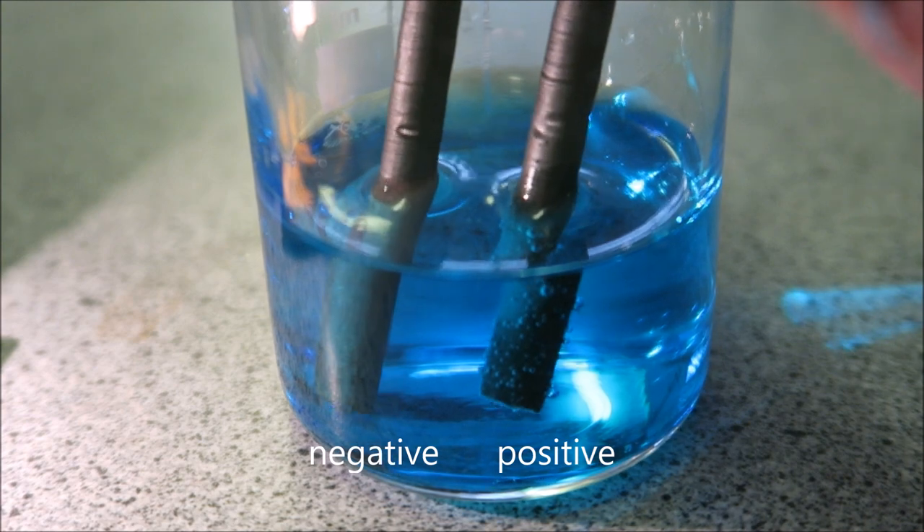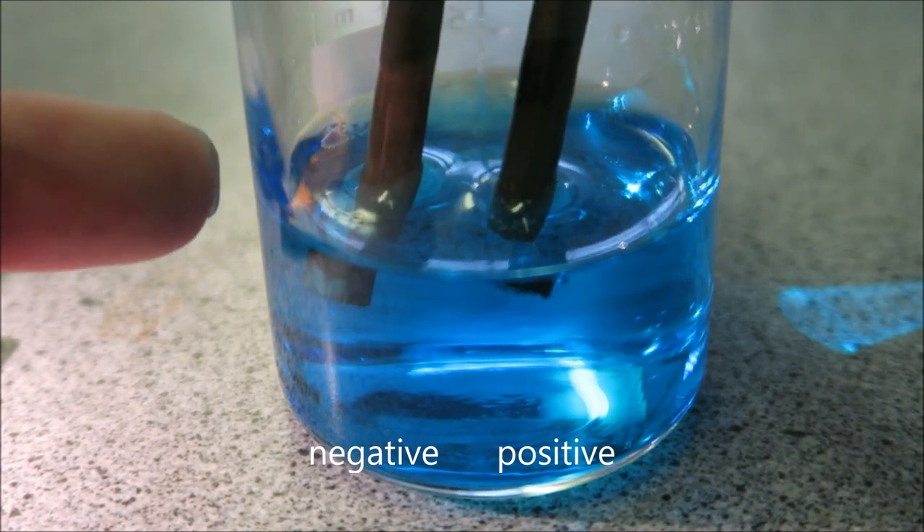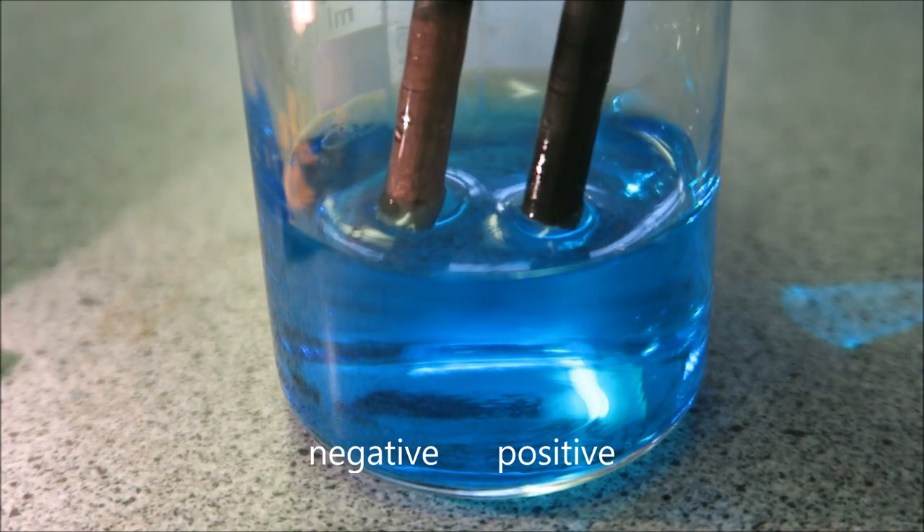It's been going for a while now. I'm just going to lift this up and hopefully you can see on the negative electrode, which is this one here, that we have some lovely copper being formed on there.